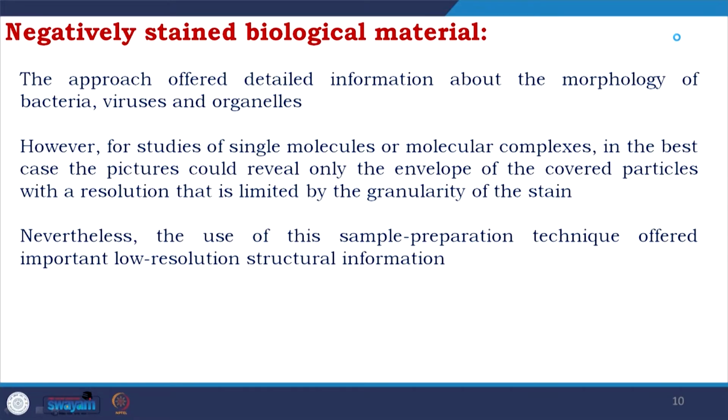Nevertheless, the use of this sample preparation technique offered important low resolution structural information, as I told, for development of basic 2D models, to check the homogeneity of the solution and all. This is very good.